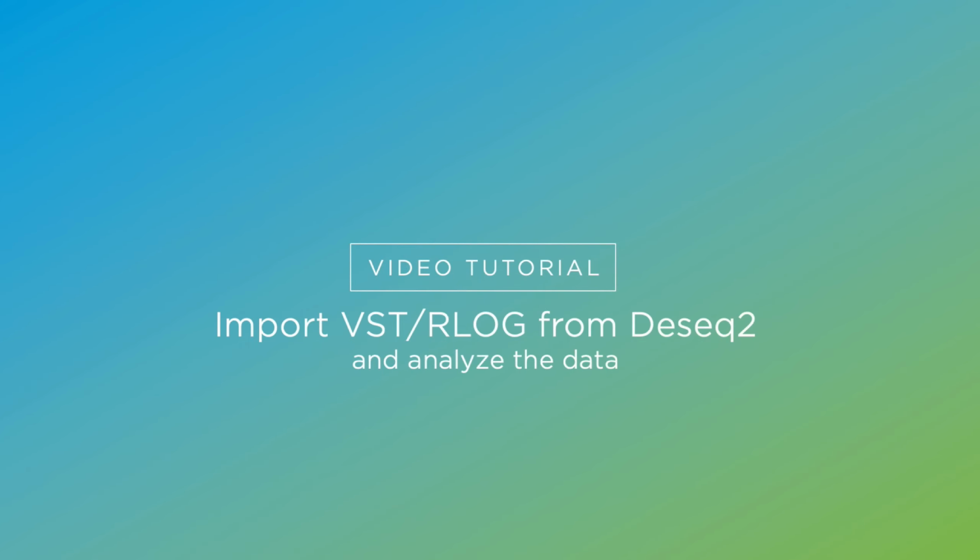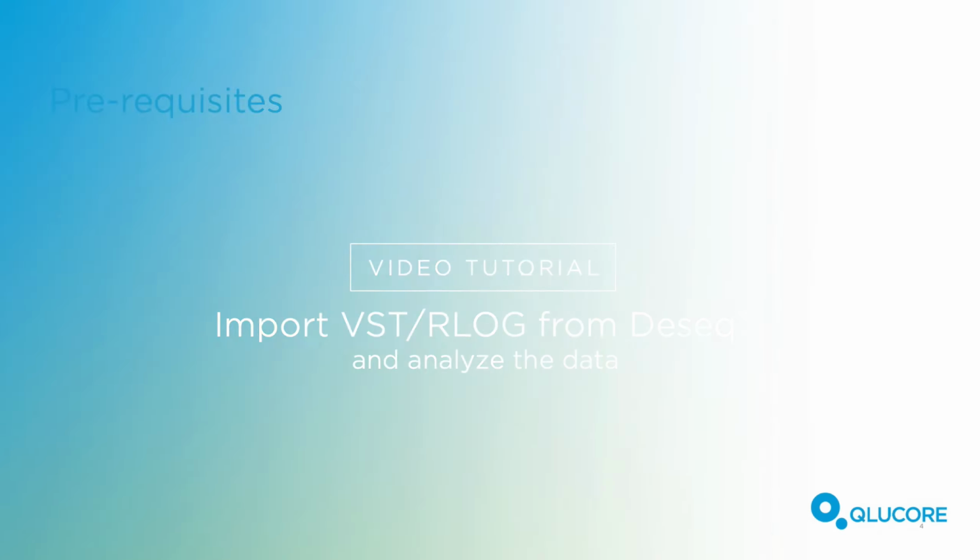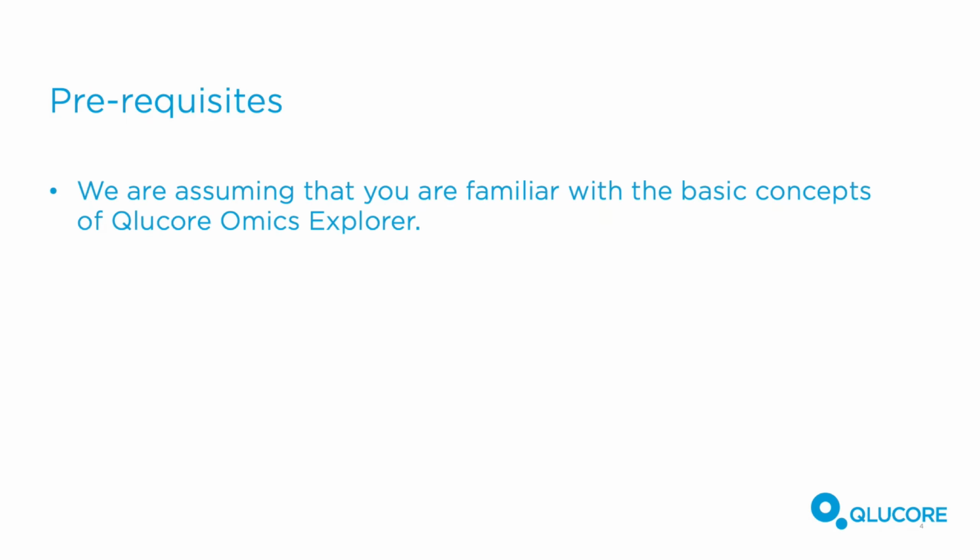In this tutorial, we will show you how to import a VST normalized dataset using the wizard, and how to explore the data and to perform statistical analysis. We assume that you're familiar with the basic concepts of Qlucore Omics Explorer.